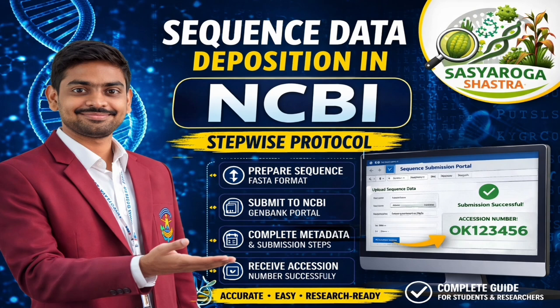Most of my juniors and my friends were asking me to tell them the protocol, like what are the steps involved in deposition of the nucleotide sequence. So today we are here with this video.